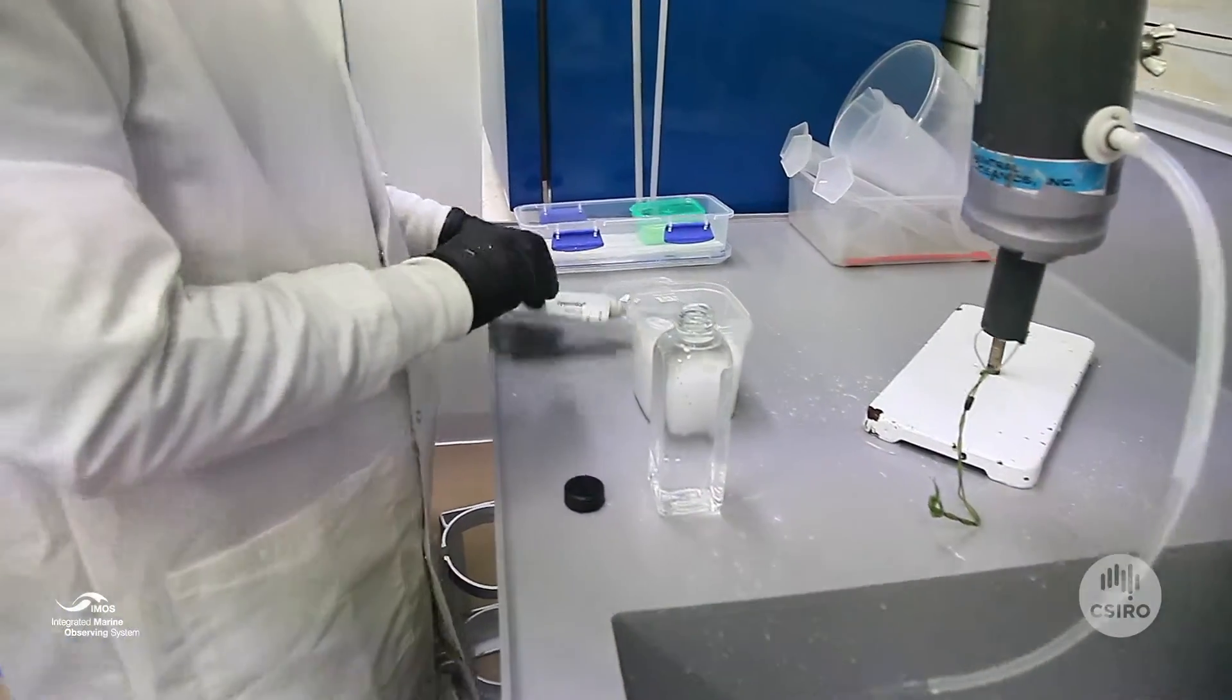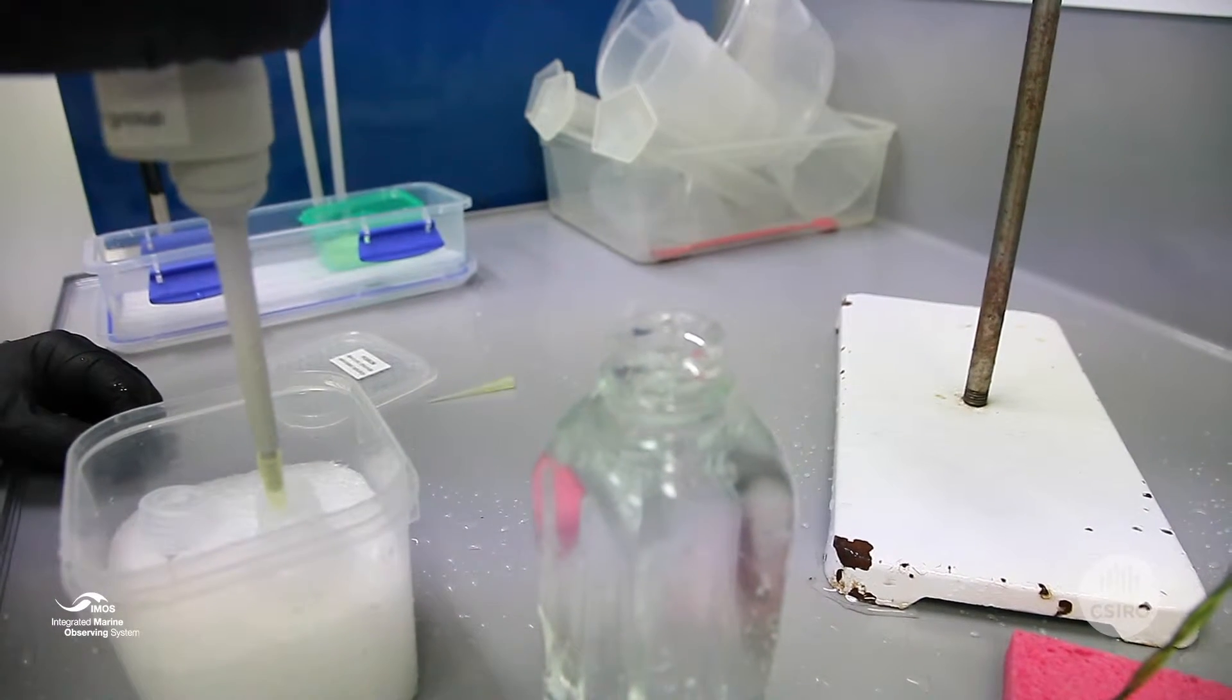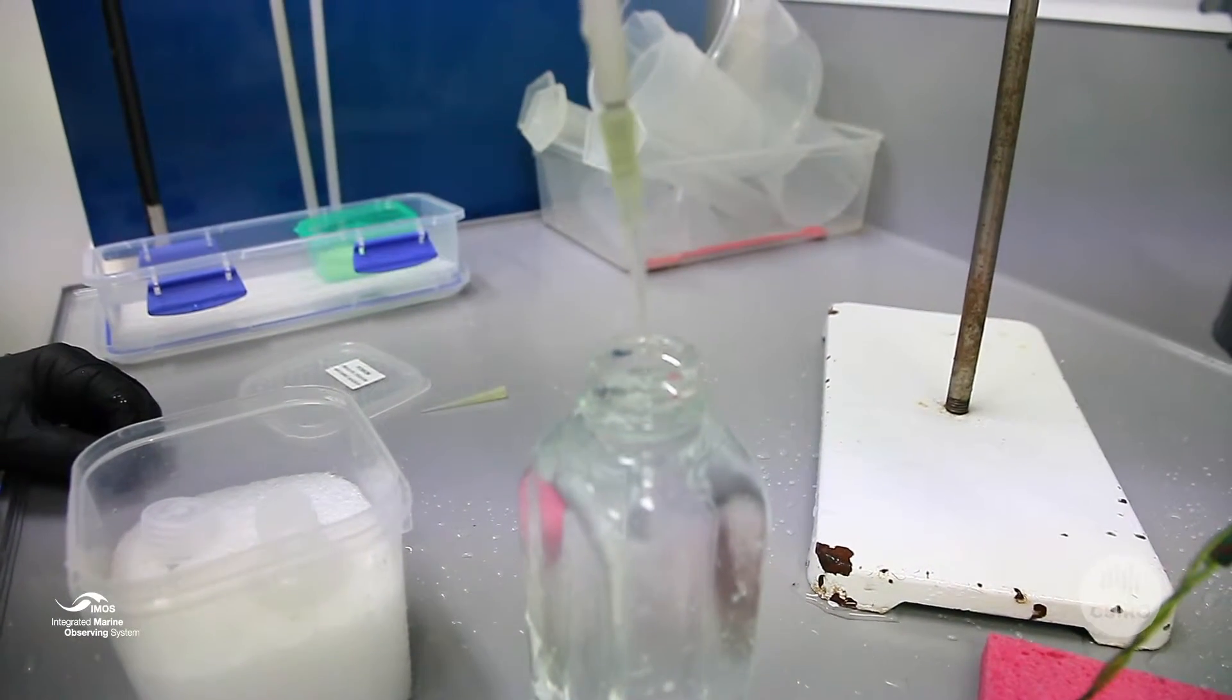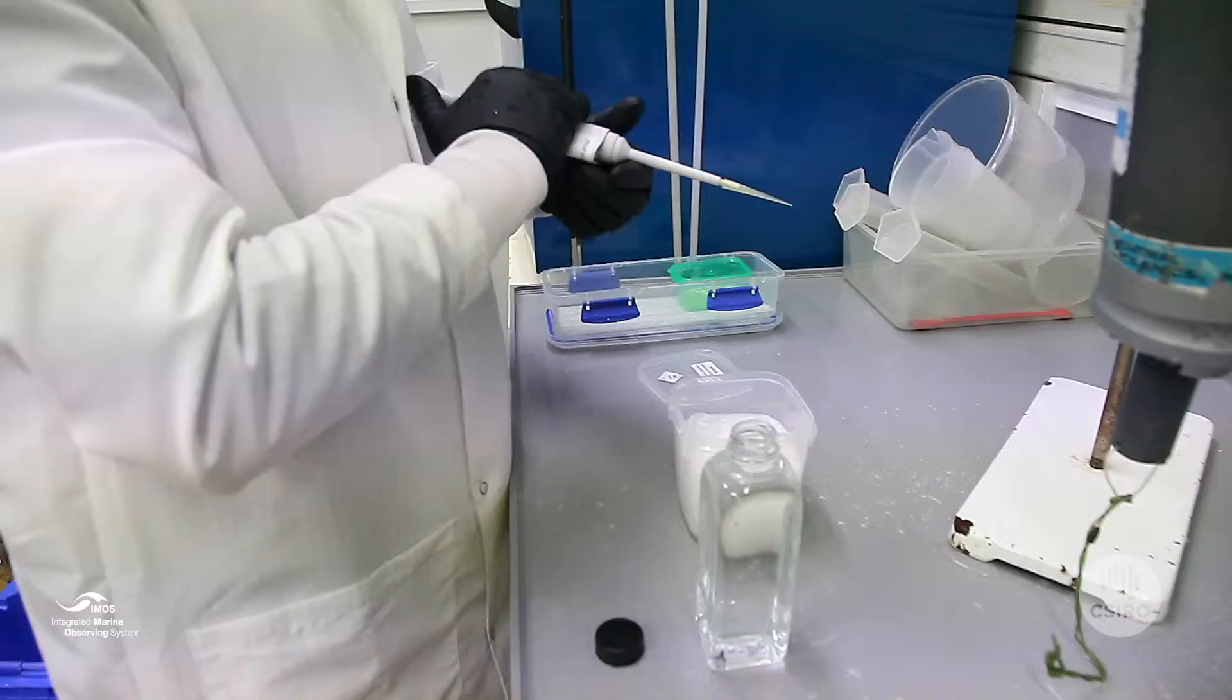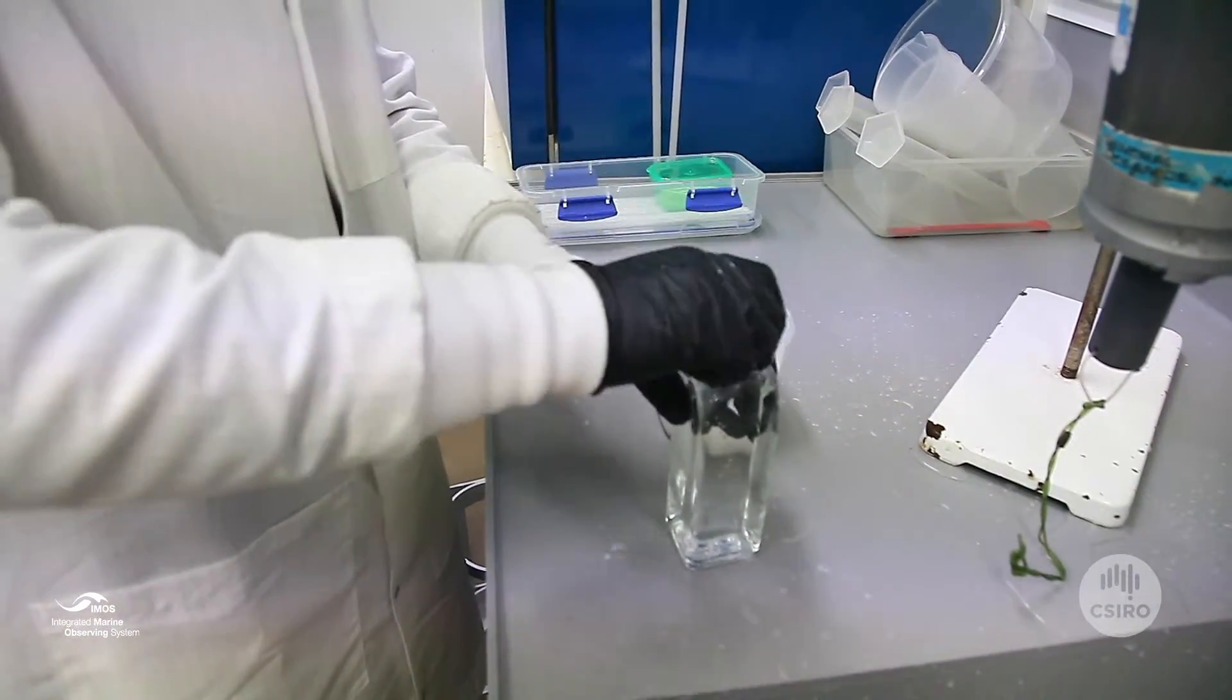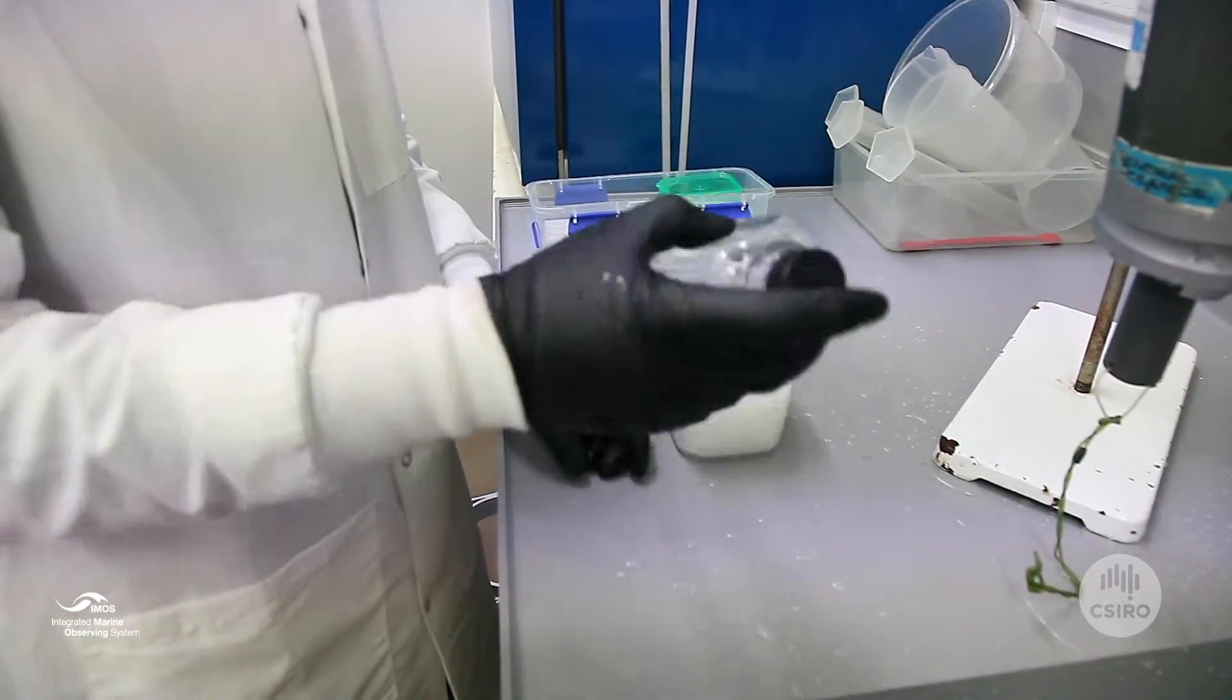Now you need to poison the sample. Take up one squirt of mercuric chloride and add it to the sample, keeping the tip out of the sample. Put the lid on and invert the sample twice.